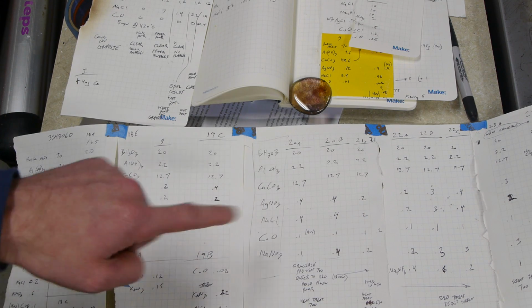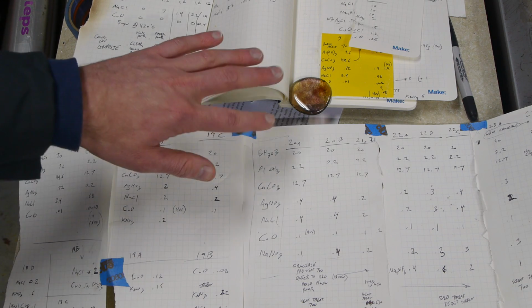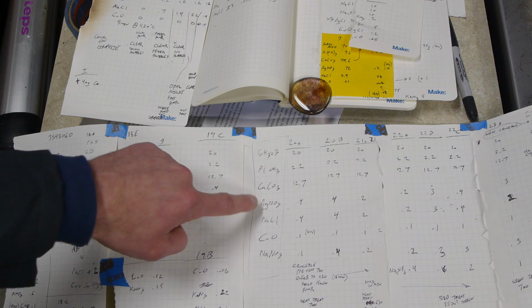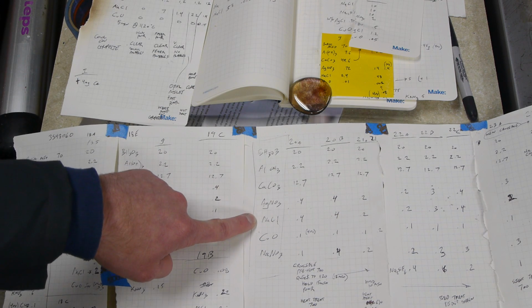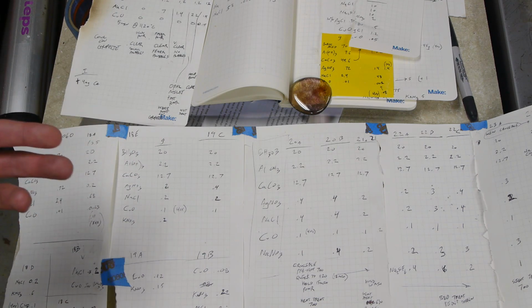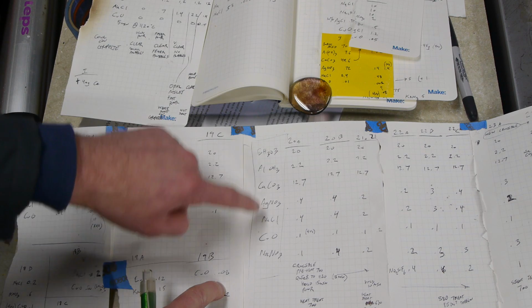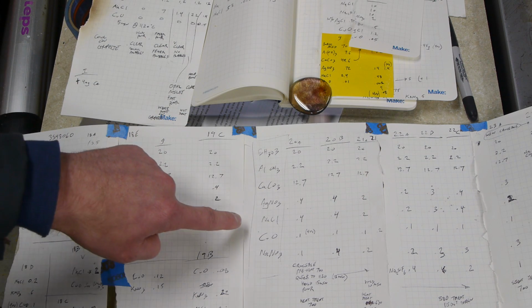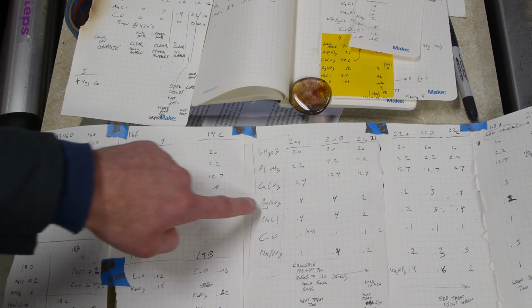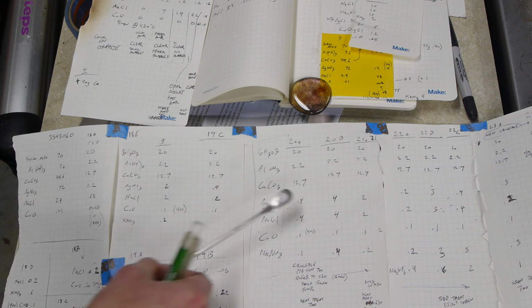This is actually the same chemical that works in old-fashioned black and white photography, and it's actually the same mechanism inside the photochromic glass. So what happens is we mix silver nitrate with sodium chloride in this glass mixture, and then as it's reacting, as the glass is being formed, these things trade places and we end up with silver chloride and sodium nitrate, and the sodium nitrate gets burned down into sodium oxide, the nitrate goes away, and we're left with silver chloride. And I have a little bit of silver chloride over here.